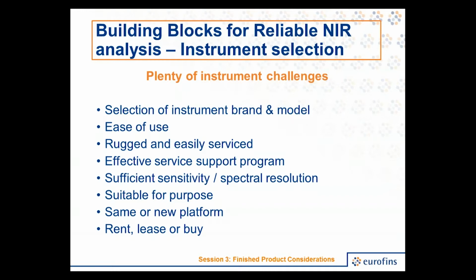Some of these, for example, might be, what is the optimal instrument and sampling device for my specific application needs, considering material types? How can I prove performance without making a capital investment? What are my needs for reproducibility, repeatability, and long-term performance? What environments, temperature, humidity, vibration in production will my instrument be exposed to? And how rugged does my spectrometer need to be? And lastly, user-friendliness. Ideally, the system should be operable by any plant operator.